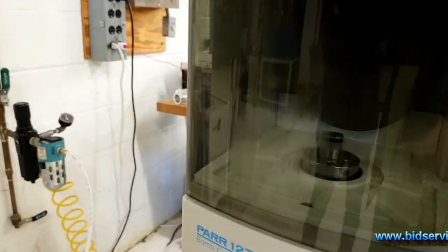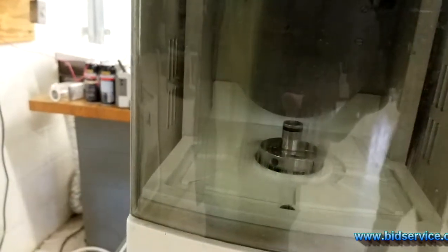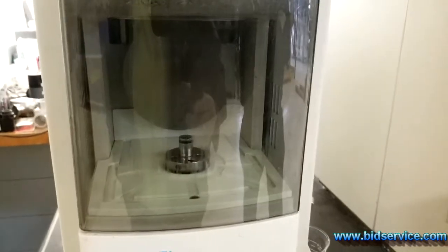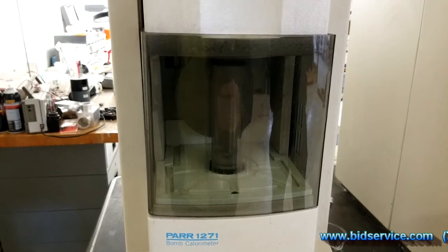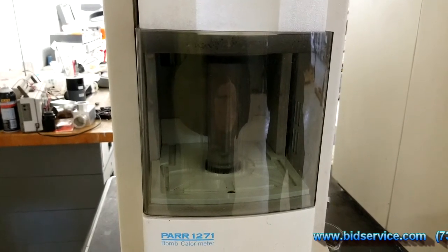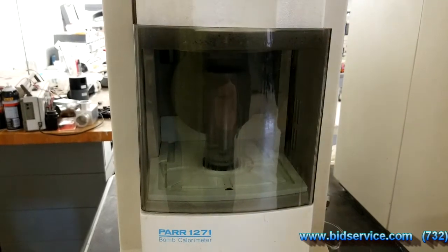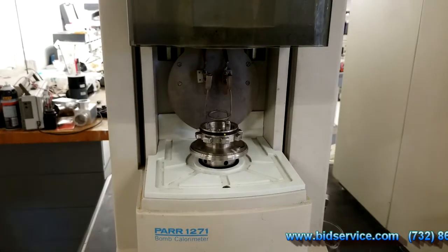And it's going to remove it and feed the head. And this is just a functionality test. The bucket is pumped out, now it's going to have to retrieve the head. And we'll do the same for tower 2, just to show that functionality. And the guard raises up.